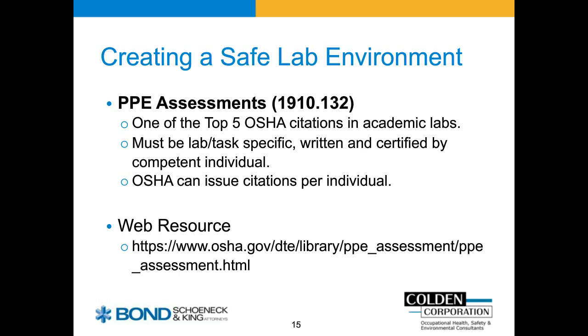They're great documents there. The PPE assessments library page has fantastic checklists on it. It doesn't have a ton of pictograms. There's a lot of PPE assessment forms out there. You can just Google it and grab one. And you folks in higher ed are so good about sharing tools. This series of checklists would be great in helping benchmark any forms you've already got or developing your own.